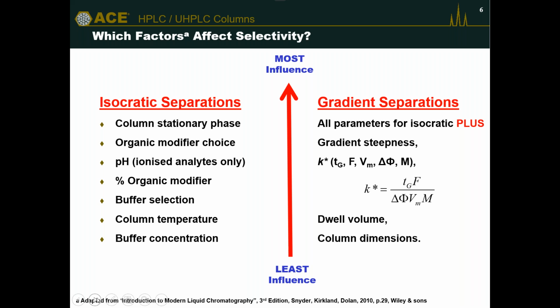They are also the three most important parameters when we look at consistent chromatography. So getting a robust method for QC, QA, we need to make sure that we are getting consistent chromatography from our column, we are making up the mobile phase correctly every time, and the pH is consistent. And I'll show you some very interesting differences you can see between very small changes or small modifications to pH.